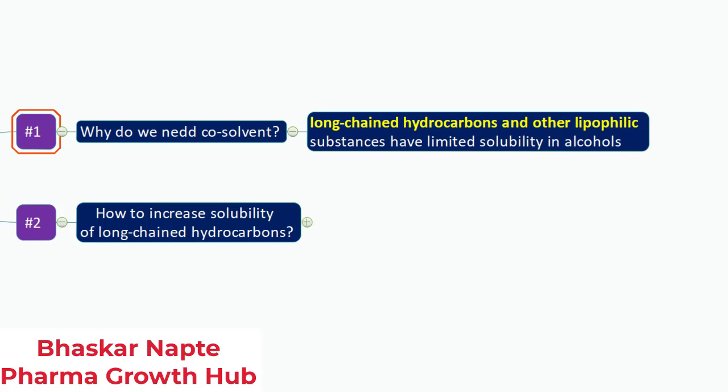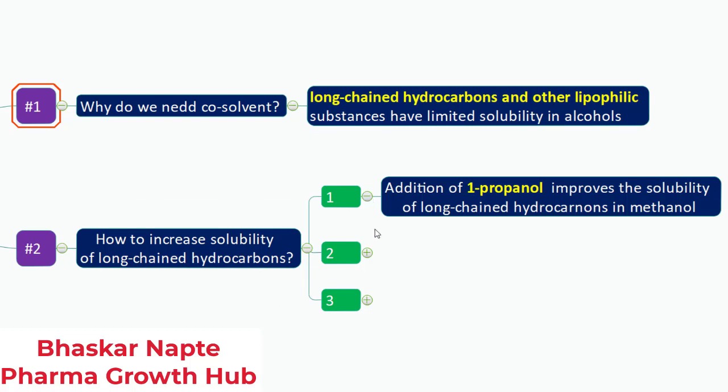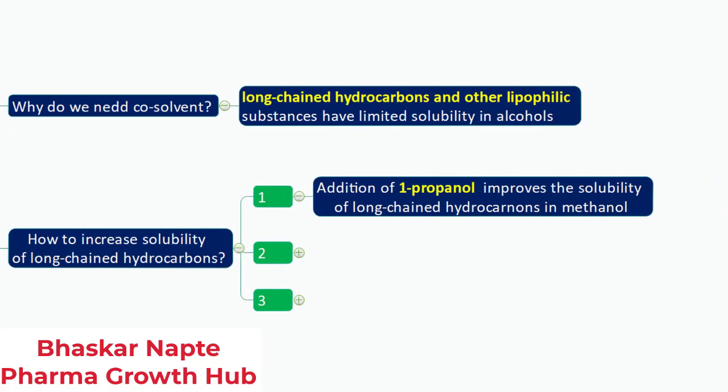So how do you increase the solubility of long-chain hydrocarbons? The solubility of long-chain hydrocarbons can be increased in the presence of 1-propanol. I am not saying to replace the methanol with propanol — you need to have methanol as part of your reaction vessel. In addition to that, you add a certain amount of 1-propanol, and this will further help in increasing the solubility of long-chain hydrocarbons or lipophilic compounds.